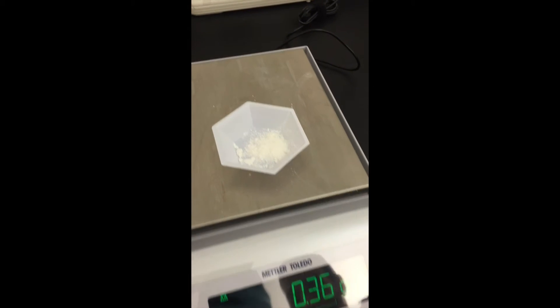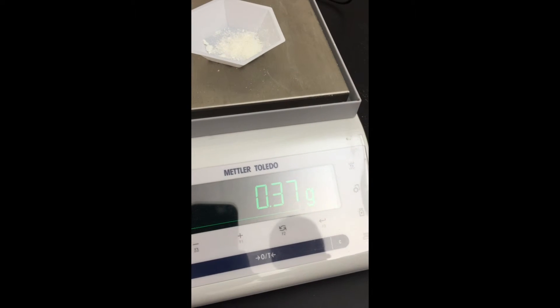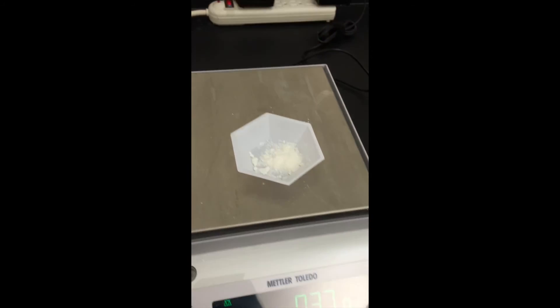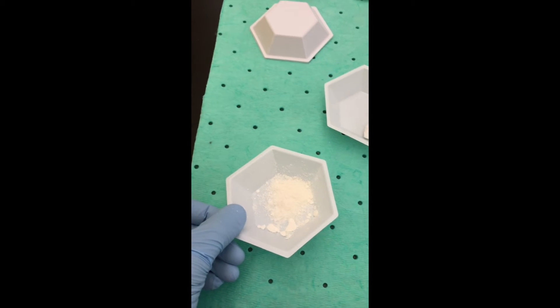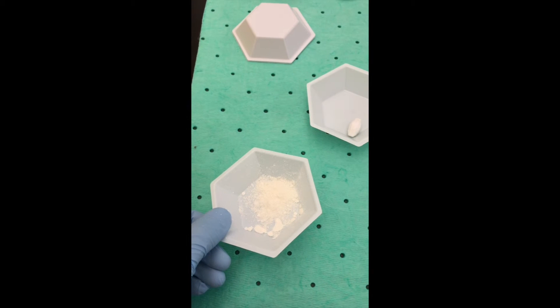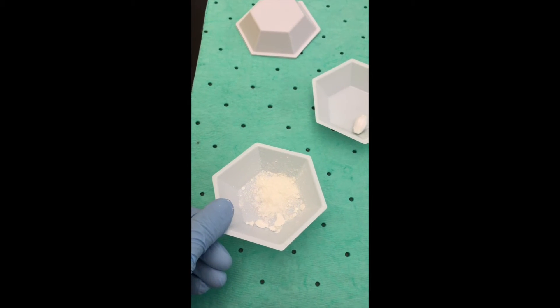So, with our final product filtered out and weighed, it looks like we come to 0.37 grams in total. We've got our final product, we are going to obtain a melting point and calculate percent yield.